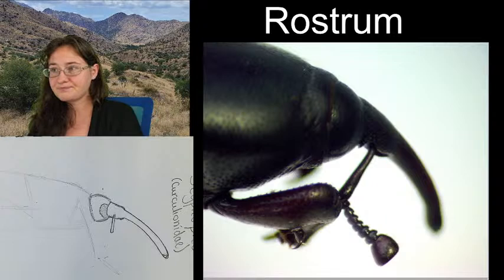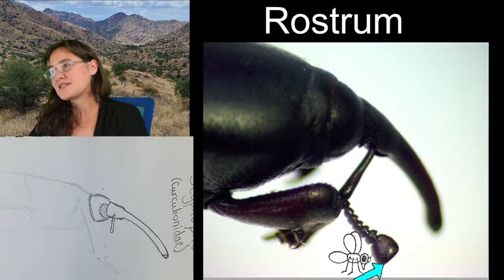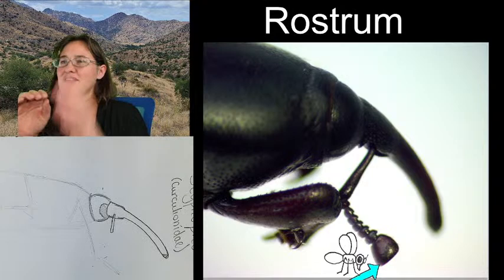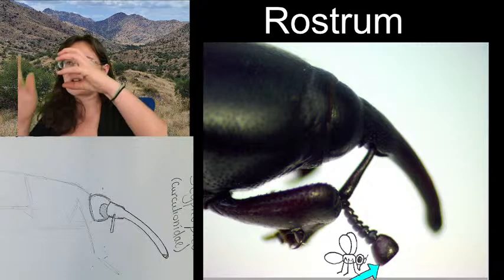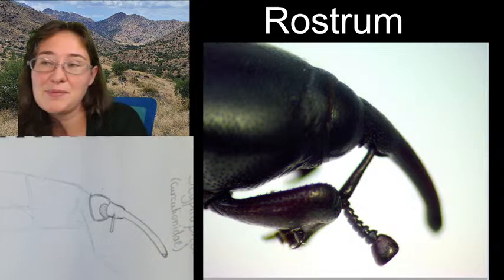I know that this antenna is really interesting because not only does it end like that, but if we were to look at it head on, we would notice that it is actually a little cup. It's not a complete half circle. It actually goes in a little bit like this. And so it's a really nifty antenna, but I'm not sure what the function is of it.